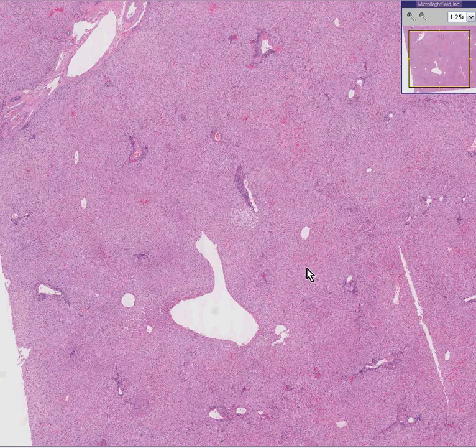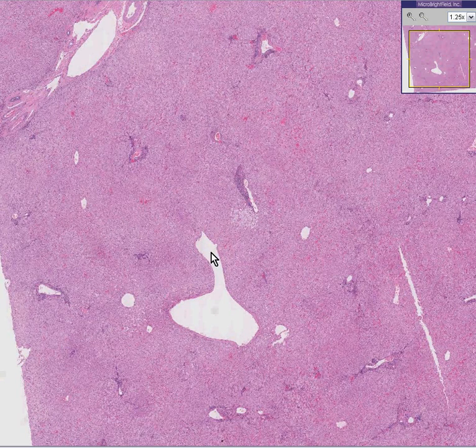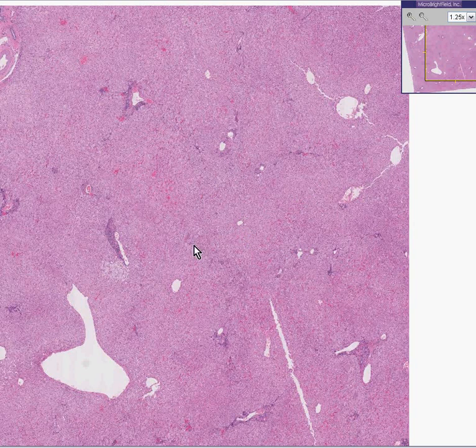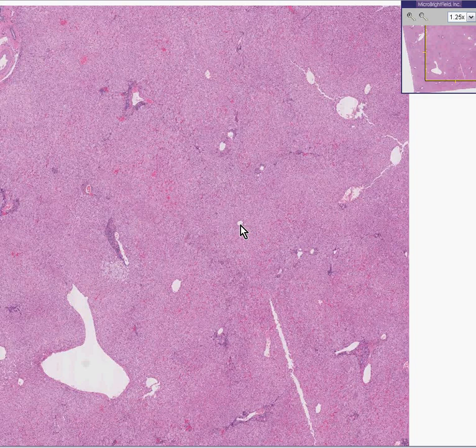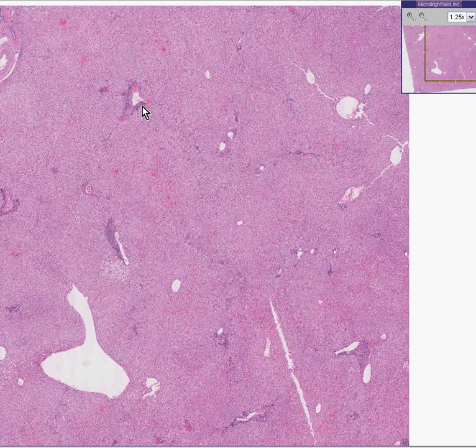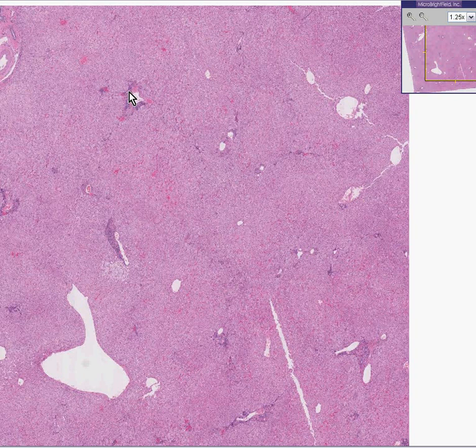If a vein appears to be all by itself, that's more likely to be a hepatic vein. And if a vein appears to be in the middle of a lobule and is small and has no connective tissue around it, that's very likely to be a central vein. But if you see a vein accompanied by an artery and a bile duct, you know that's the portal part of the lobule. If you see a vein by itself, that's the central vein.